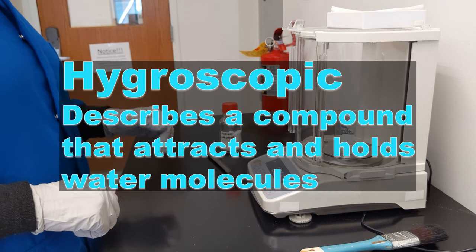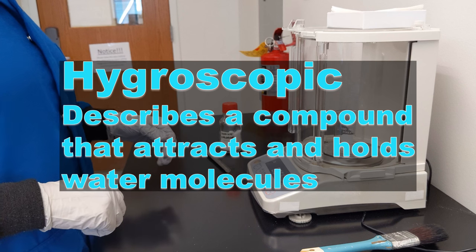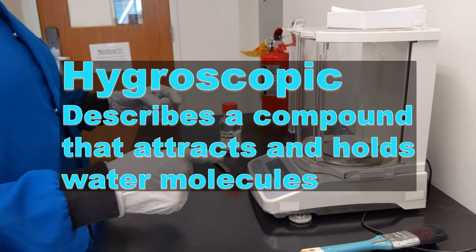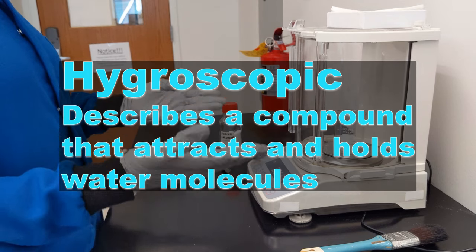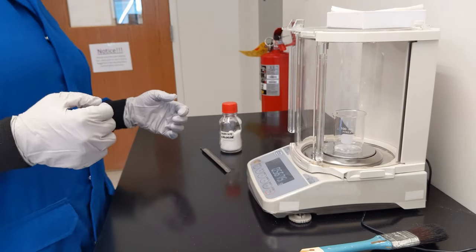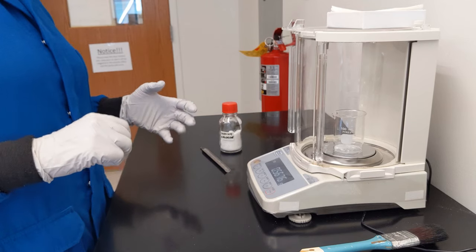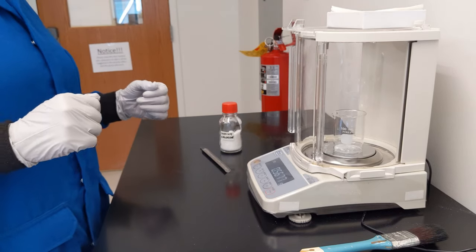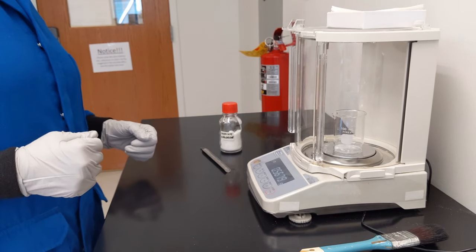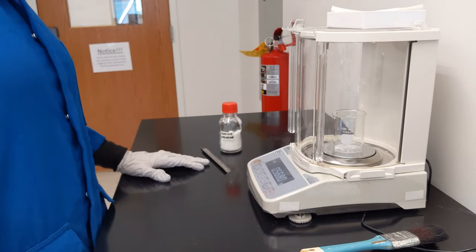There are some solids described as hygroscopic that absorb water very easily, such that if you're in a humid room, you'd be seeing the mass climbing up and up. If that is the case, you want to record the very first mass, because the longer you wait, the more water will be absorbed and the higher the mass reading is going to be — the worse your value is going to be.